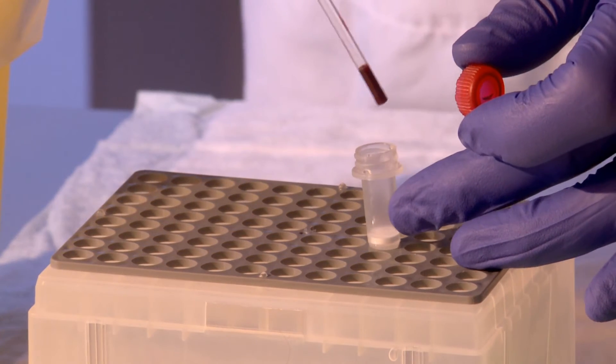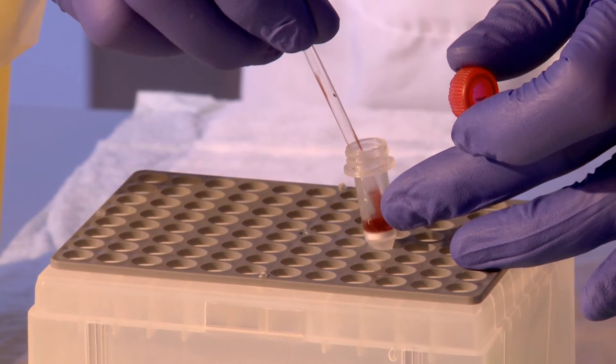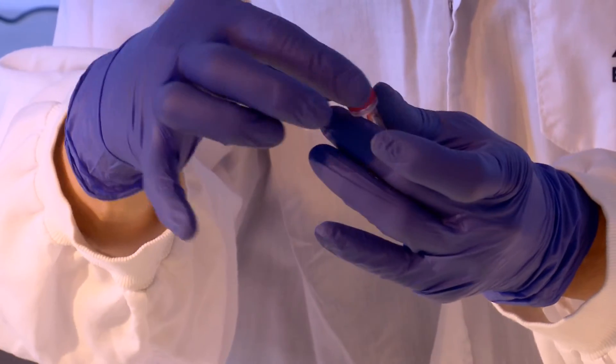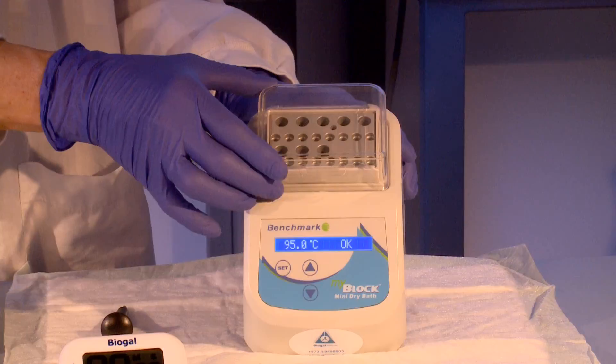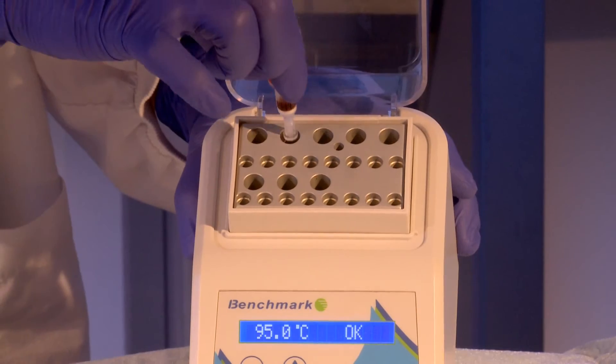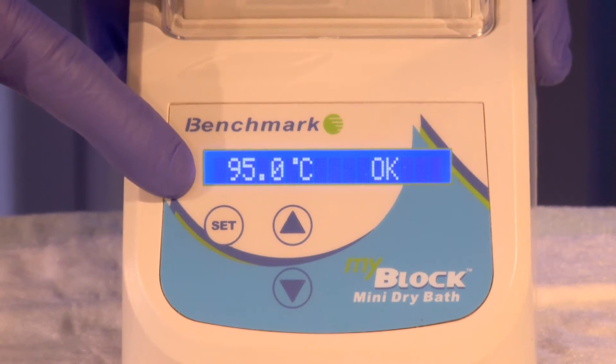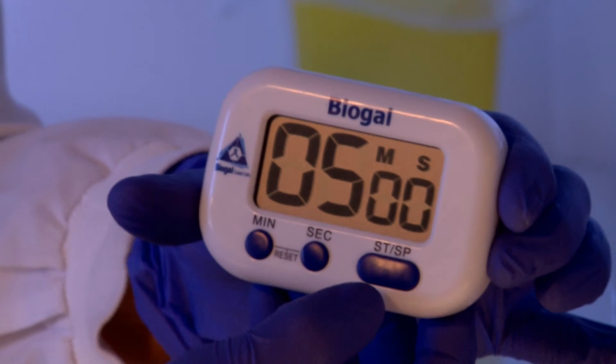Add this blood to the extraction buffer found in the column. Close the column lid firmly and mix by tapping lightly on the side of the column. Place the column into a hole of the preheated block and allow it to incubate at 95 degrees centigrade for exactly 5 minutes.